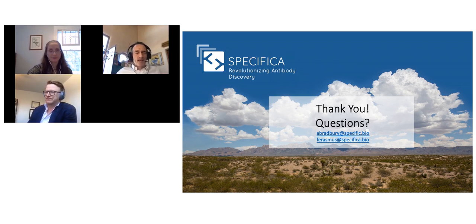So we have seen trends, and it's all very antigen dependent, and we don't quite understand what's going on there. For example, some targets really like the VH1 scaffold. Other targets really like the VH3 scaffold. That said, that happens when you mix the libraries together. If you mix all the libraries together and select against a particular target, usually what we find is dominance of one particular scaffold. However, if you take each scaffold separately and select against each independently, then we tend to get binders from each of the scaffolds. So there is a bias, but that bias can be overcome if you use these scaffolds singly and independently.